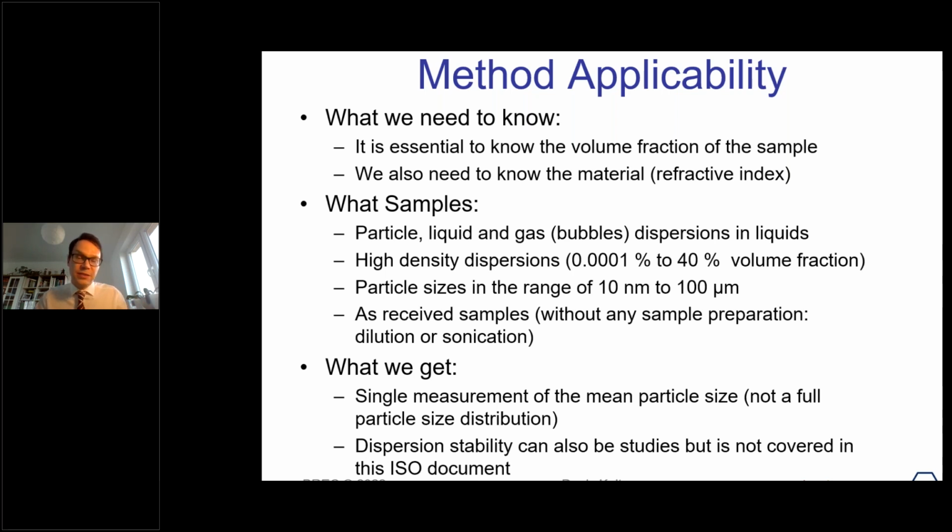The concentration of the sample can vary from 0.0001% to 40%. So it's a pretty big range, in my view. Beyond 40, people have done this, but there are certain packing restrictions of how you pack the particles in denser materials, denser dispersions. That becomes a problem.